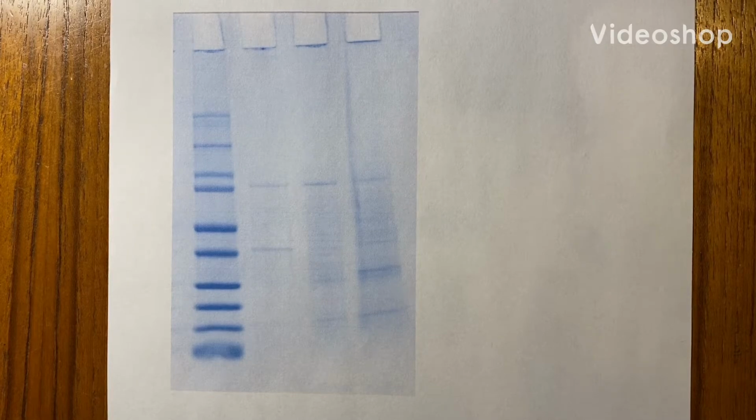Hello, welcome to my next tutorial on how to analyze your laboratory data. This is how to analyze the protein gel picture that was sent to you earlier this week. So here's a picture of the gel that I sent you.